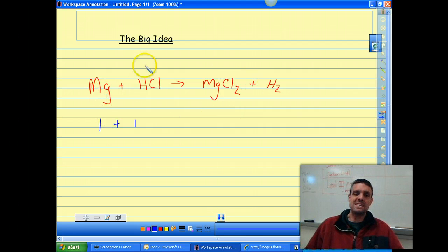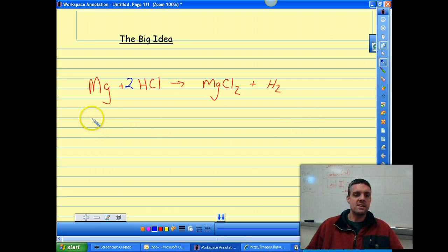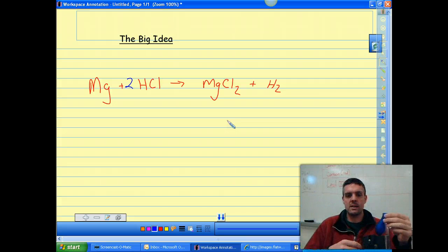And that's what this is, this balanced chemical reaction. When I do this right there, it is truly just a recipe, all right? And it says, hey, you need 1 part magnesium to 2 parts hydrochloric acid in order to produce these products, okay? So here, like I said, I'll go ahead and pour this in.